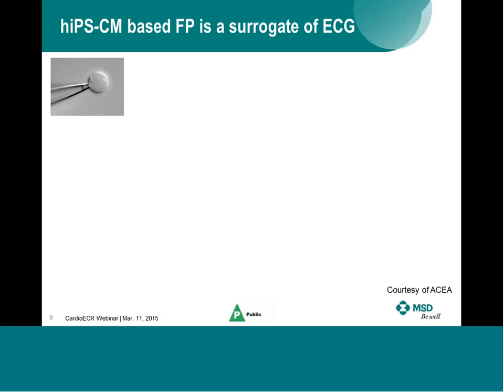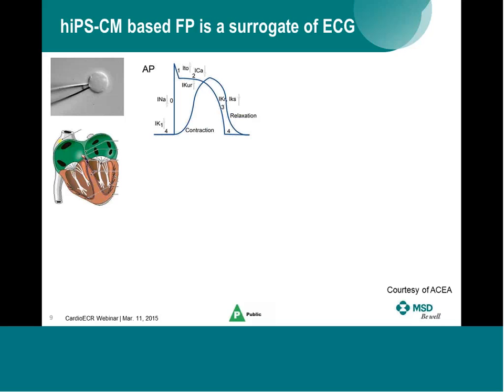This is a classic single-cell patch clamp recording to measure action potential from either stem cell-derived cardiomyocytes or even from freshly isolated cardiomyocytes. And this is the heart, and this is the surface ECG signal, which is the ensemble of all individual action potentials.